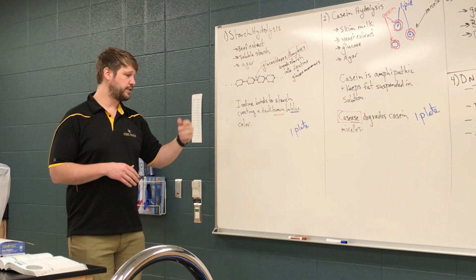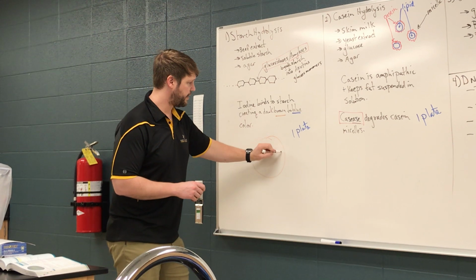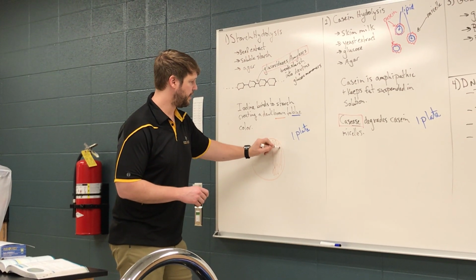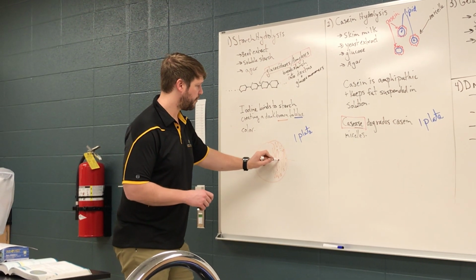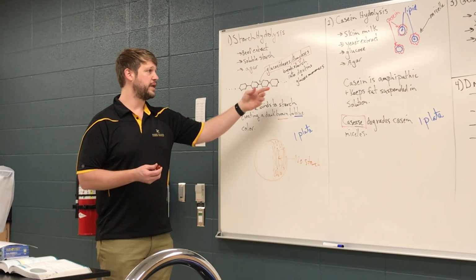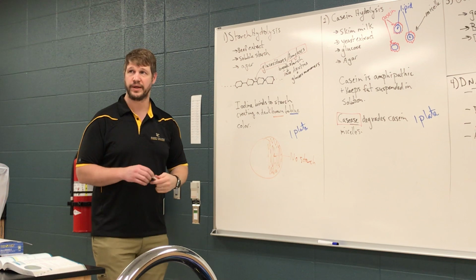And so what you'll actually see after you've done this, you'll see where you streak the organism, you'll actually see a clear halo around it, right, where there is no starch present anymore because the organism has these enzymes, these glucosidases or amylases, that have degraded it in proximity to where the organism was growing.